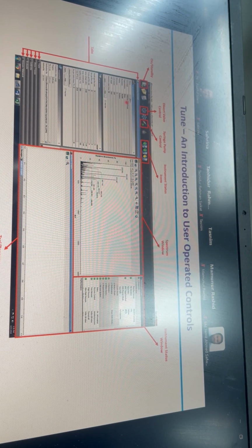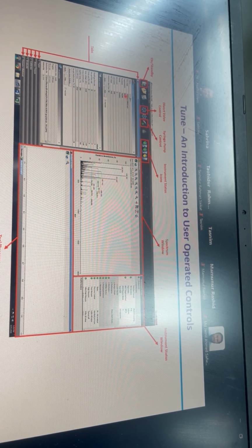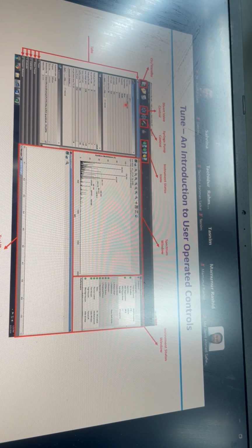You can scan the mass of your analyte from 100 or 50 to, it depends on what type of molecules you are analyzing. If you are analyzing a very high mass protein, then you can use from 500 to 12,000 mass to charge ratio. Whether you want to do fragmentation. So these are the scan parameters, and this is the HESI, meaning heated electrospray ionization, parameters you can control.